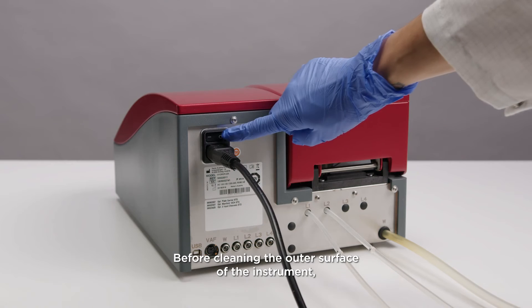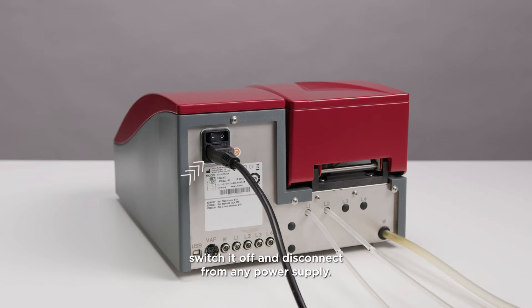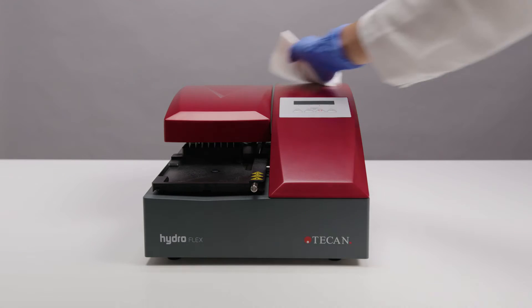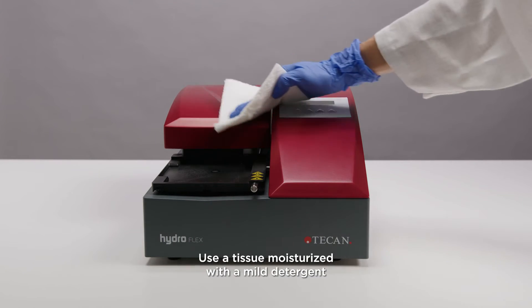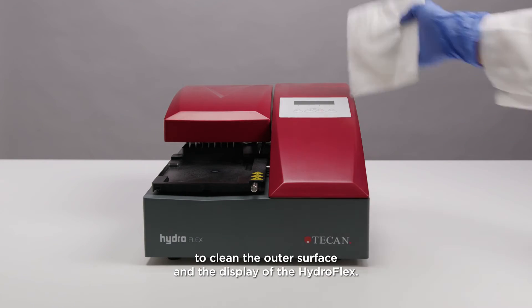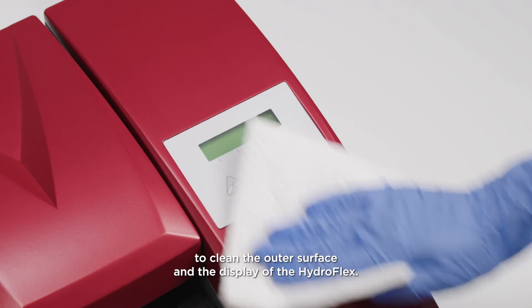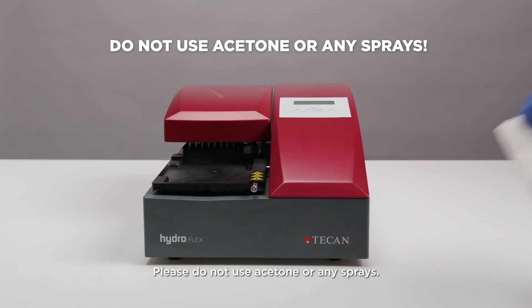Before cleaning the outer surface of the instrument, switch it off and disconnect from any power supply. Use a tissue moisturized with a mild detergent to clean the outer surface and display of the HydroFlex. Please do not use acetone or any sprays.